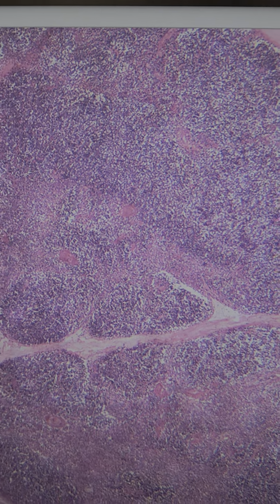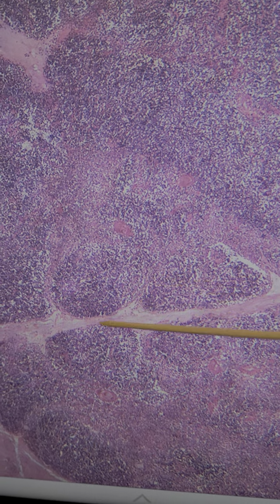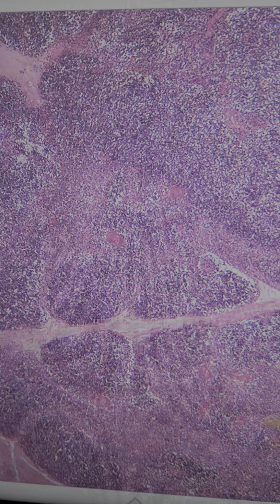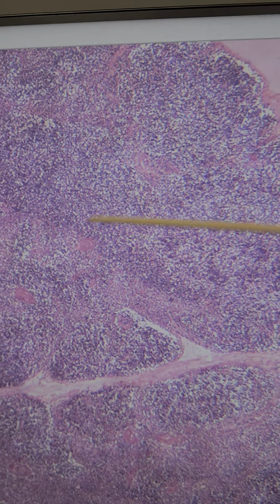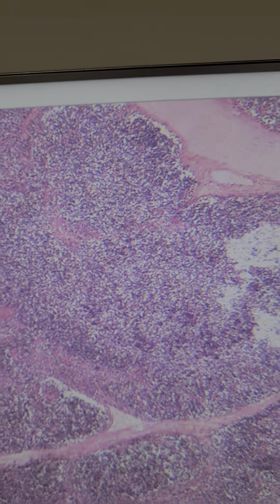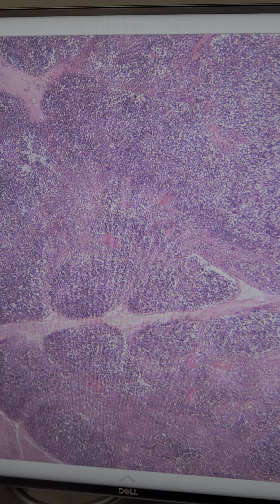This is actually the thymus of a fetus, and you can see some of the lobulations in here. And here we have the cortex is going to be slightly darker than the medullary region. This is on lowest power. I wanted to show you the lobules for this thymus in the fetus first.